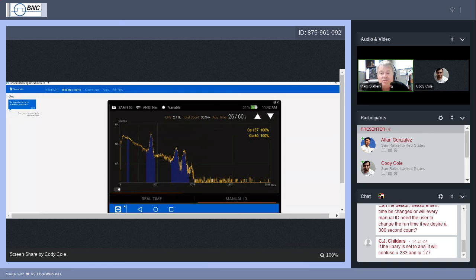Now, those of you really into statistics know that there's never really a 100%, and that statistical certainty begins at around 95%. I'm just bringing this up to show that the SAM is kind of quite heady and full of itself and believes in certainty. Therefore, we have the 100%. I'm certain that that's what these are. 42 seconds after 60 seconds, measuring.